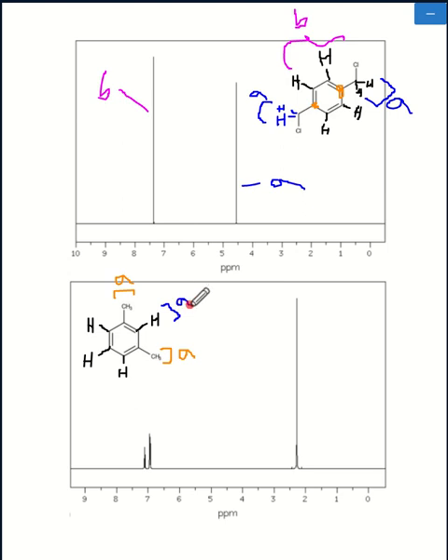Let's label that A, because based off of symmetry, it's the only one that is between both methyl groups. So based off of symmetry, it would get its own label. And then the other carbons that are adjacent to the carbons with methyl groups, each of those carbons have a single hydrogen that, based off of symmetry, are effectively the same thing.